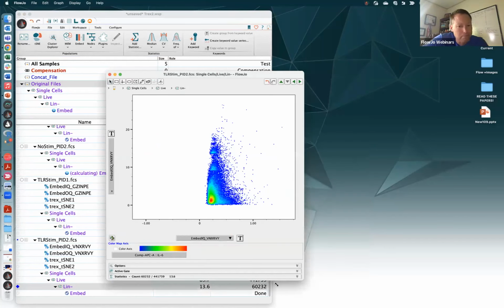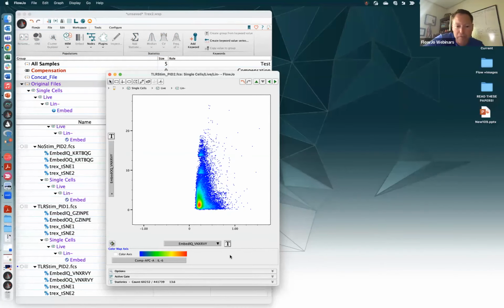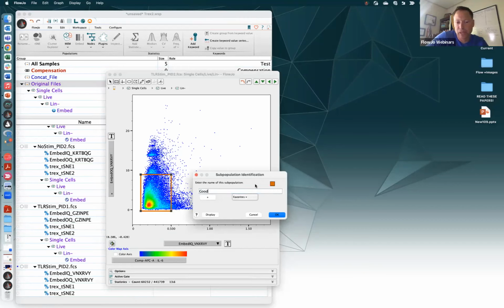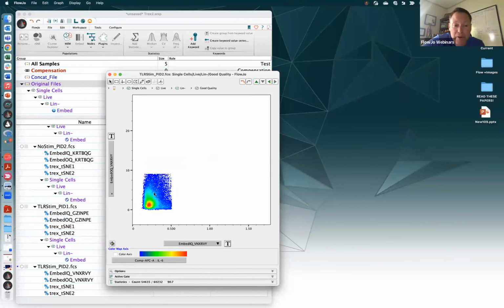Okay. Just a note, we by default include that -1 region for things that were not included in the population. If you're working on just the things that you've worked on, switch this to go from 0 to whatever the max is, you can do that. So that's cool. And so maybe I will put in something like that to get the bulk of the cells that have good quality. And we can just compare the differences and see if it actually makes a difference on this one or not. Playing around with this, I have found that sometimes it matters, sometimes it doesn't.